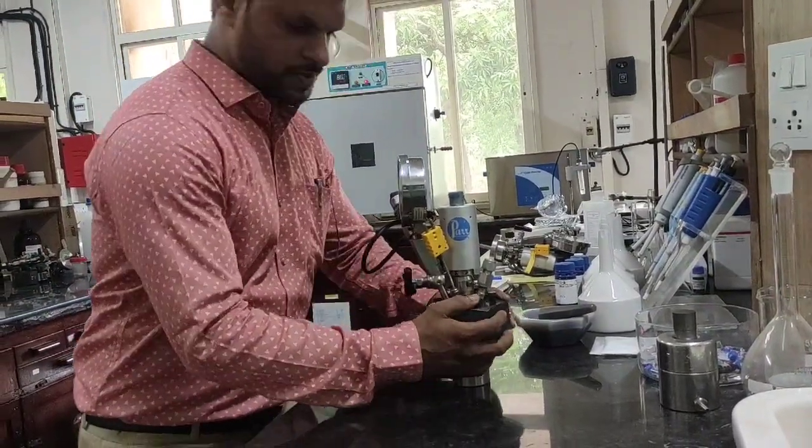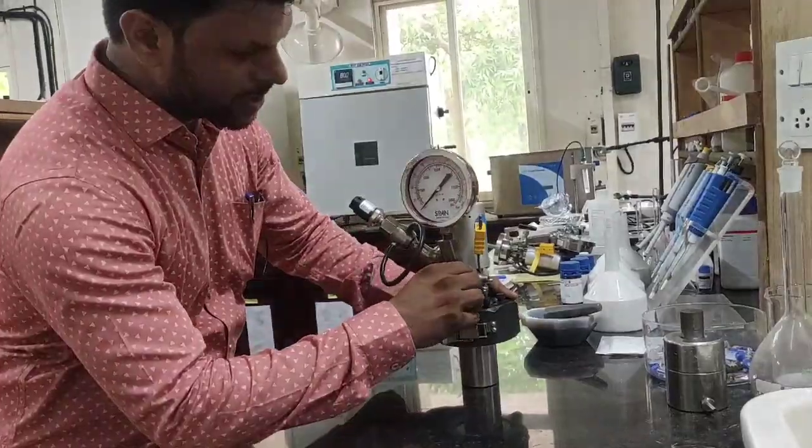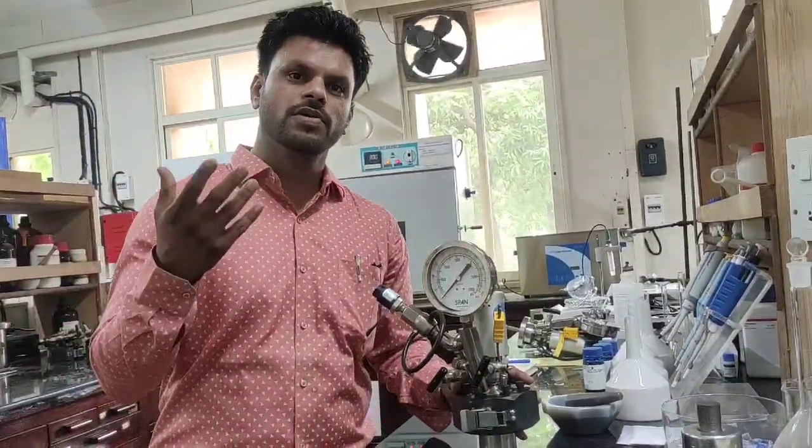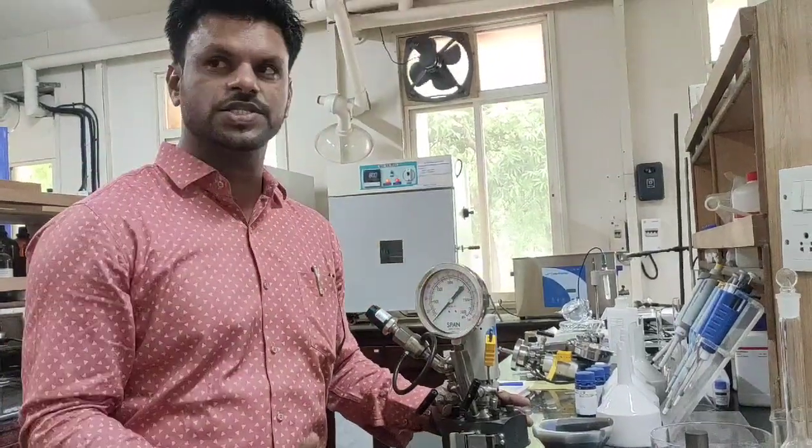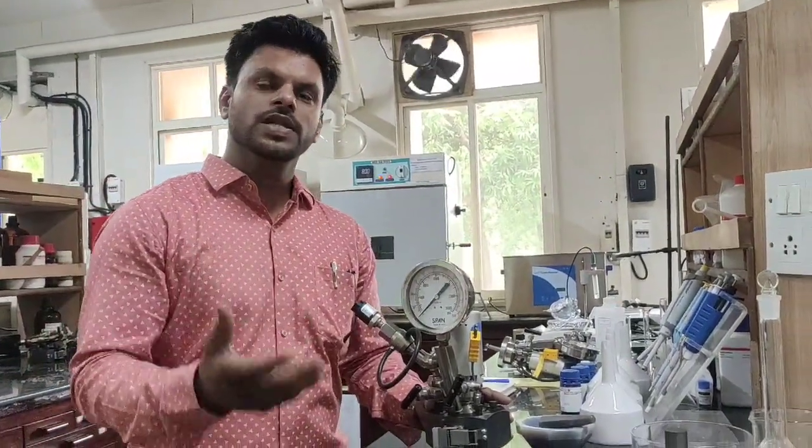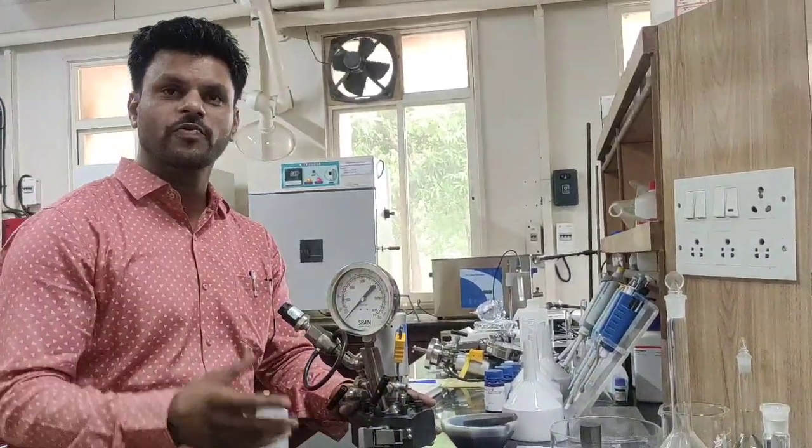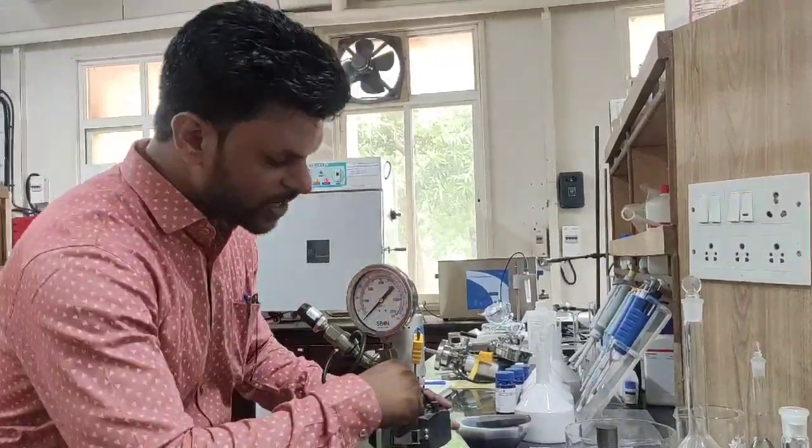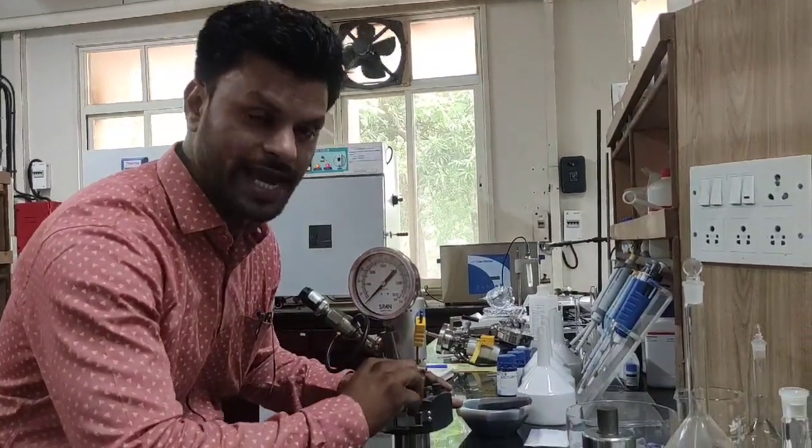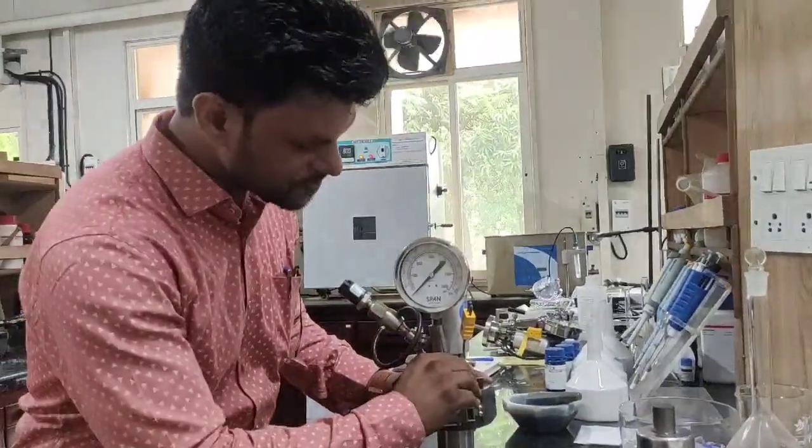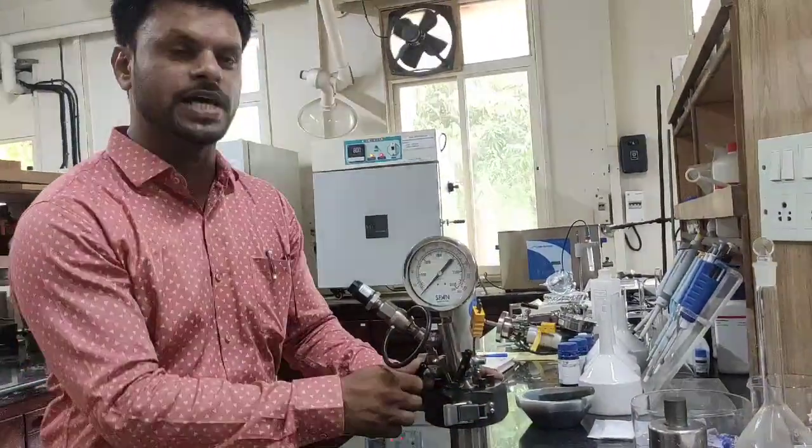And these knobs are given, one is for inlet and one is for outlet. Say for example if you are carrying out hydrogenation reactions, so you need to give hydrogen gas here. With the help of a cylinder, we can fill hydrogen gas to your desired pressure like 5, 10, 20 bar pressure and you need to close that.